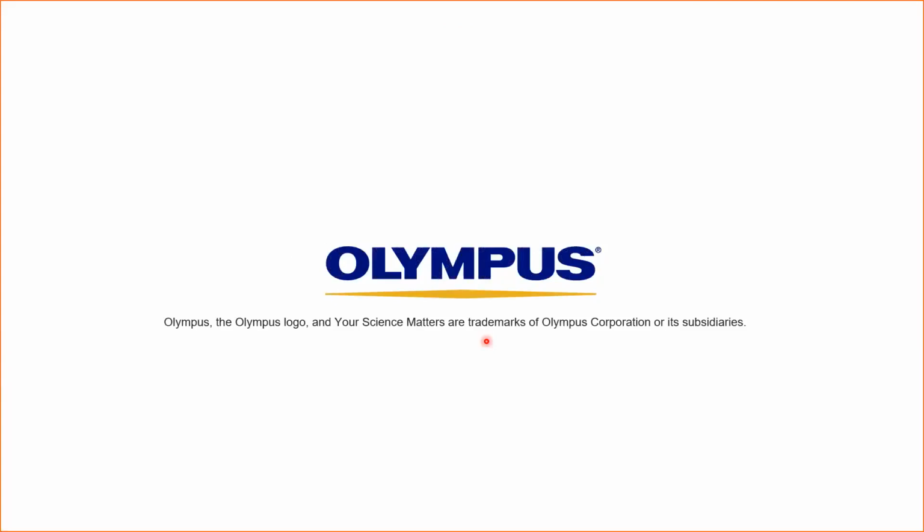This one would be for Tim. What would be the optimal concentration of antibody to label a whole mouse brain that's cleared? Again, I would not recommend trying to label a whole mouse brain. I would consider working in hemispheres or even smaller slices.